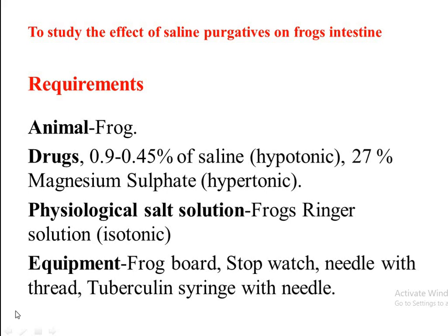Hello students, in this PowerPoint presentation I will discuss the study of the effect of saline purgative on frog intestine. So the requirement will be the same as before: we will use the animal, the frog, and the drug.